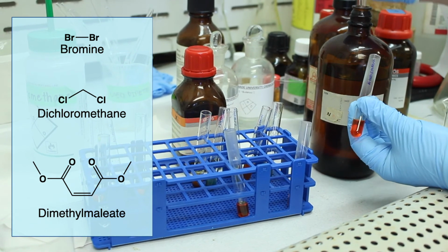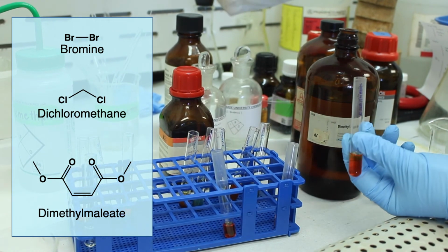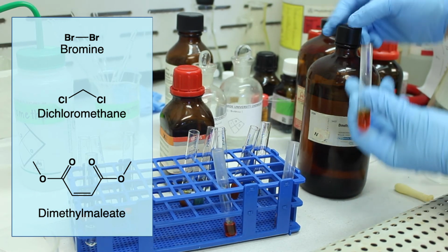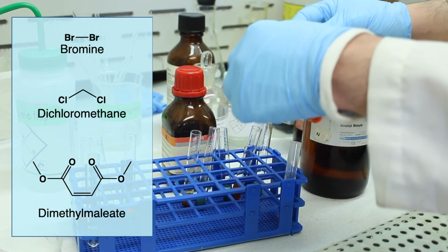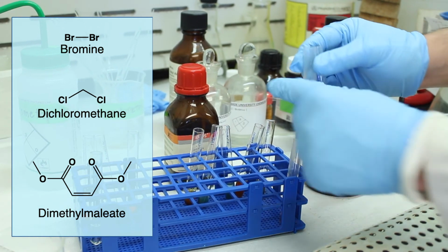Got our test here. Okay, so I put a generous portion inside there, and as you can see, no reaction. If I agitate it, it lightens a little bit, but if we compare it to our control, it looks about the same. So control on the left, dimethyl maleate on the right.